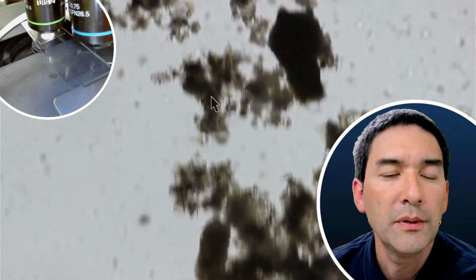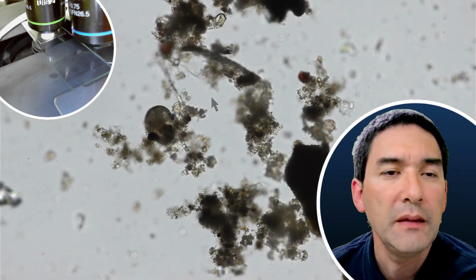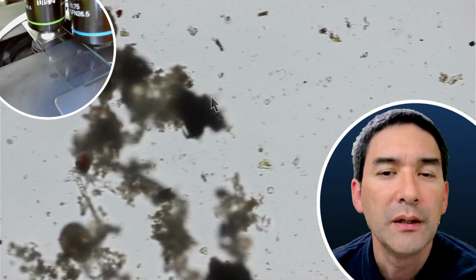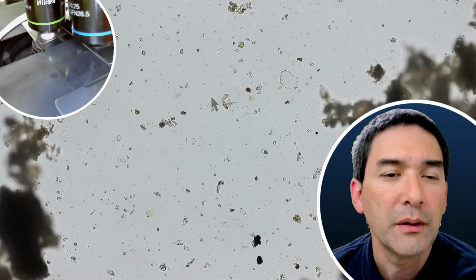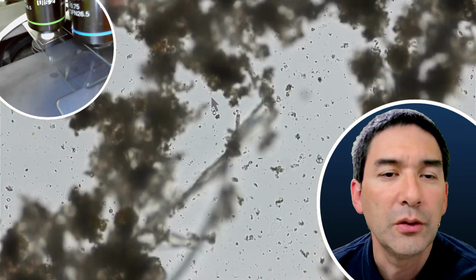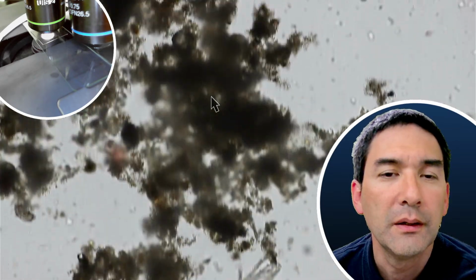If you see something like this, then I recommend that you make a video with a time lapse, and occasionally you are able to see movement better. Okay, and occasionally in the background maybe you can see this moving dot. There are possibly bacteria or small ciliates or flagellates, but not in the concentration that I was hoping to find them. Okay.